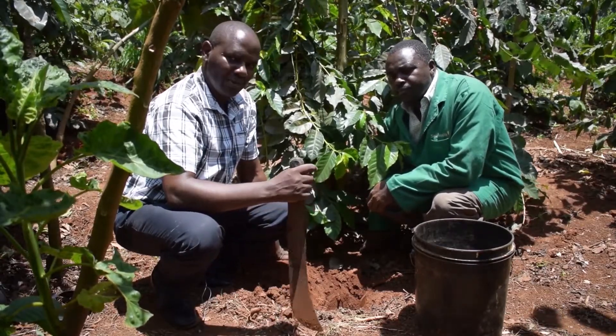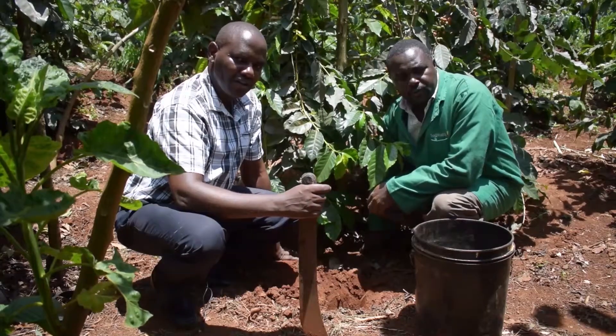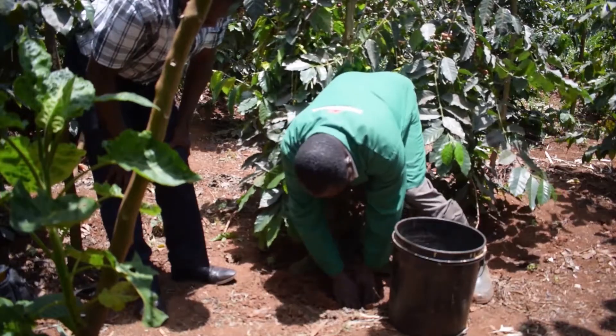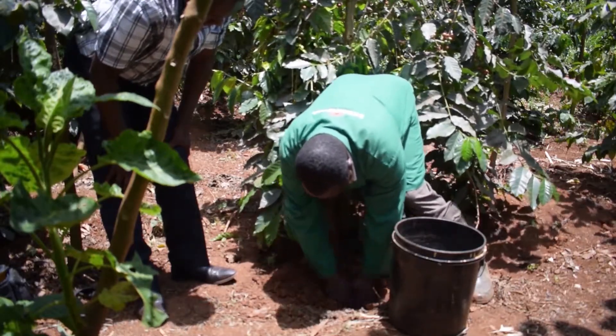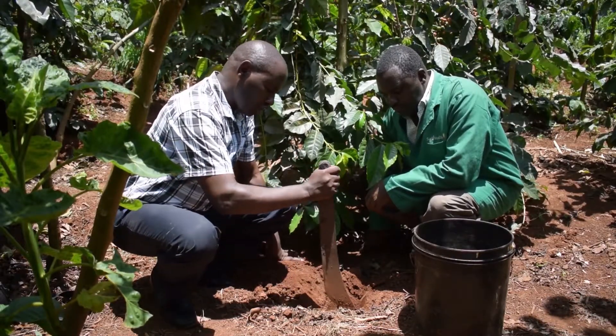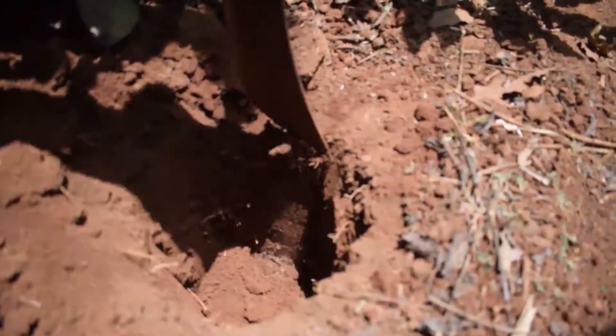Now where we are, we are somewhere at the center. We will take seven holes and we have already dug one hole, one foot deep, and removed all the soil.